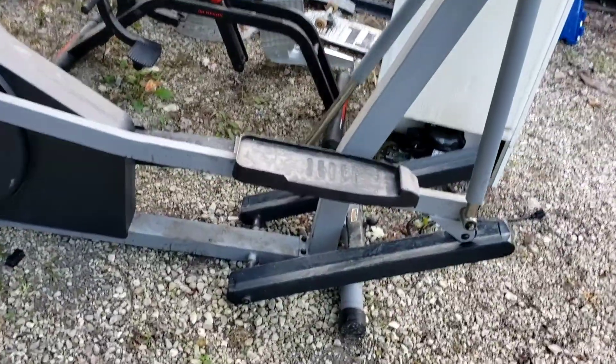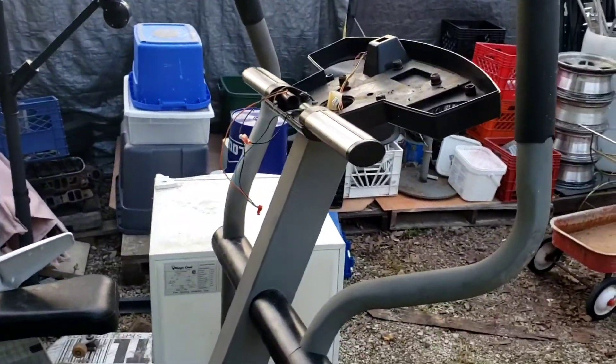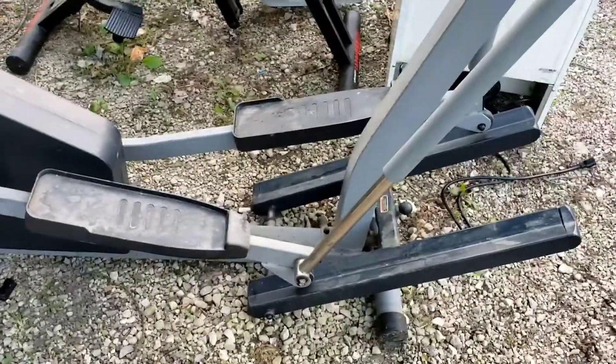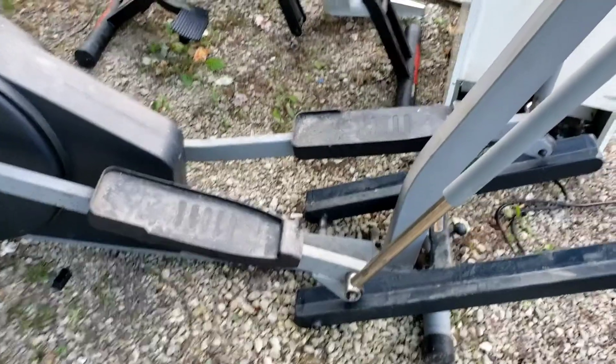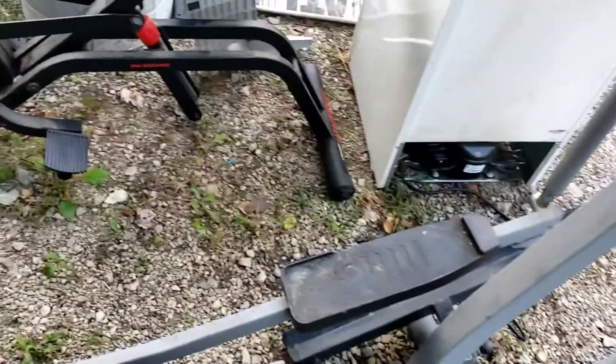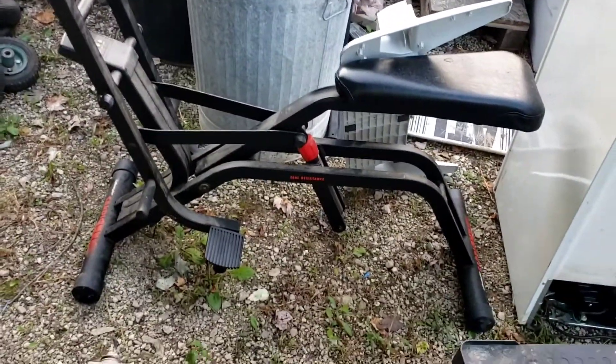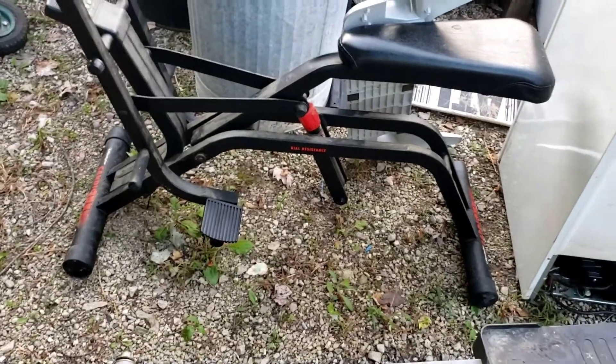Nordic Trek - I come across so much of this equipment. This guy actually worked, had a computer board and stuff on it that we took off. But I mean, you see how dirty that is. There's basically the same thing, just a generation before it looks like.